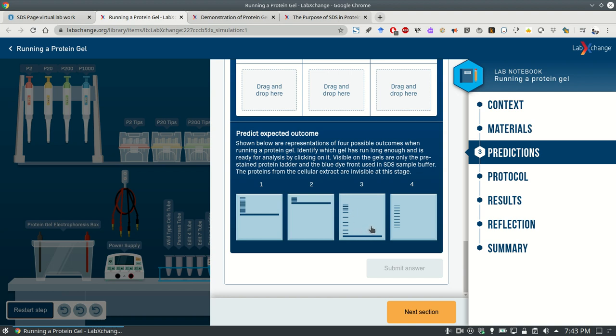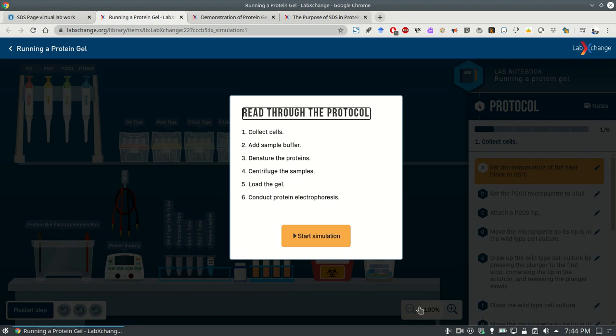So if you wanted to use those proteins for some other experiment, like mass spectrometry or something, you would have to remove the Coomassie blue. But that's very hard to do. It's almost impossible. It's not impossible, but it's very hard to do. And it's just not worth doing, usually. So that's why you do not stain them right off. If you know that you're not going to use these proteins for anything further, then yeah, go ahead, stain them with Coomassie blue. But usually you don't want to do that unless you're sure that all you want to do is see the proteins in here, and that's all you want to do. Okay, so you'll answer those questions, and you will check out the protocol.